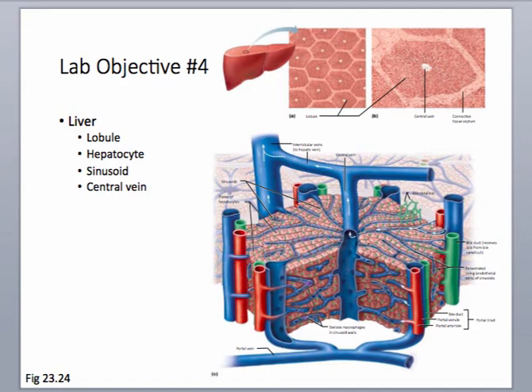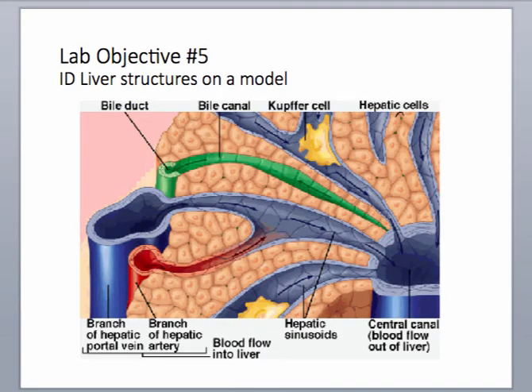that's being produced. If we go back to the other picture, one of the other types of cells we can see in the sinusoid is called a Kupffer cell, which is also known as a hepatic macrophage. And what this means is a macrophage is a big phagocyte, and phagocytes are basically scavengers looking for harmful materials.